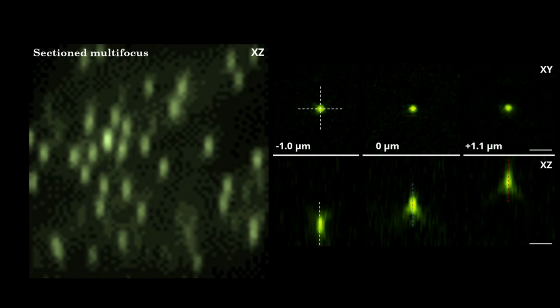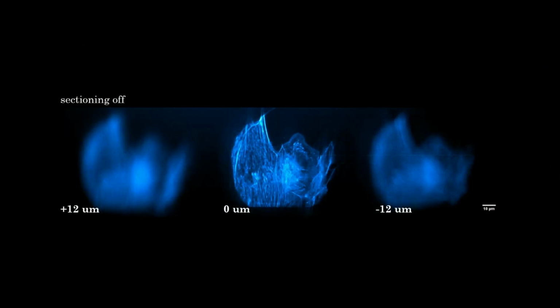So these are beads. And you can see that this was a beam splitter cascade multifocus microscope. And we have 3 different focal planes. And they all depict the same bead in different focal positions at the same time. In real cells, it looks like the following. So this was done with a 40x objective, and the magnification changes how far apart these planes are that we're imaging. So these were plus and minus 12 microns apart from the nominal focal plane. And you can still see there's a lot of out-of-focus light in these planes.